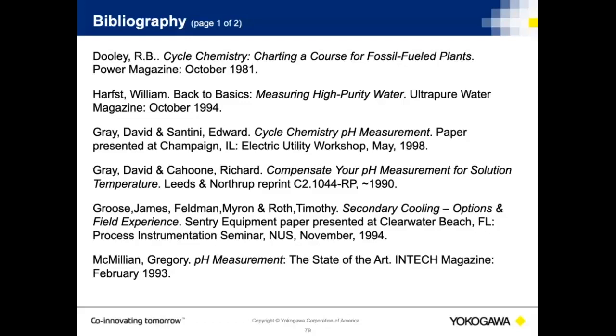The only issue you have to watch in both of those cases is that the reference junction itself is still a ceramic plug. And that ceramic does require basically sanding from time to time. Well, here's the issue that I see mostly happen in that case. With the reference, the Bellomatic, people are told in the instructions that they should sand it lightly every time they calibrate it. Well, be real careful how often you sand it, because you just want to hit it basically to knock off any of the buildup.